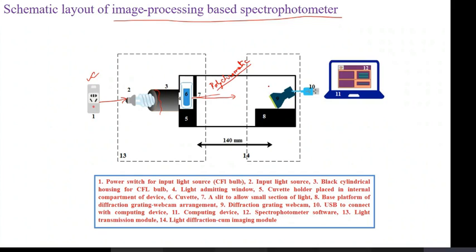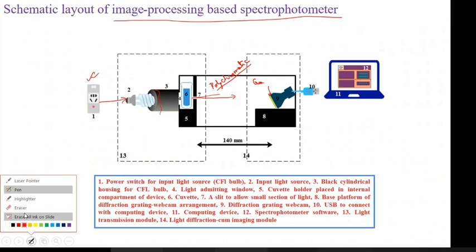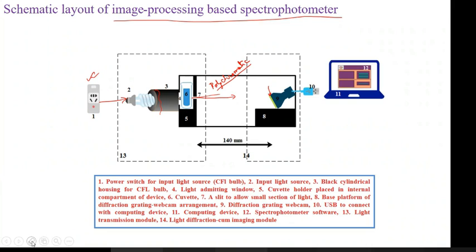Now this slide, it goes, and if you look in this, the green area is the grating. Sorry, today it's a bit cold here, so my fingers are getting frozen. That's why my writing is a bit wonky, so please bear with me. So this green part is the grating.